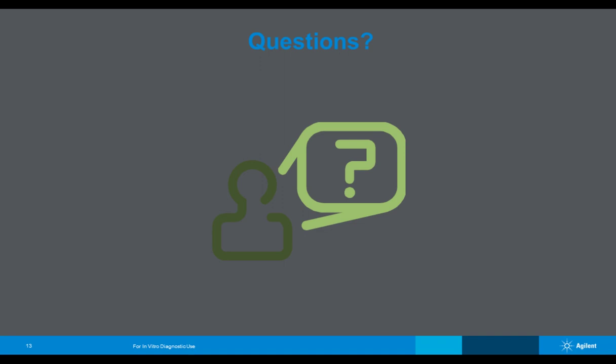Wonderful, thank you. Our next audience member wants to know, we are getting a 6545XT QTOF system here shortly. Is the Study Manager available for our system? Yeah, that's exciting to see. The QTOFs are great systems.